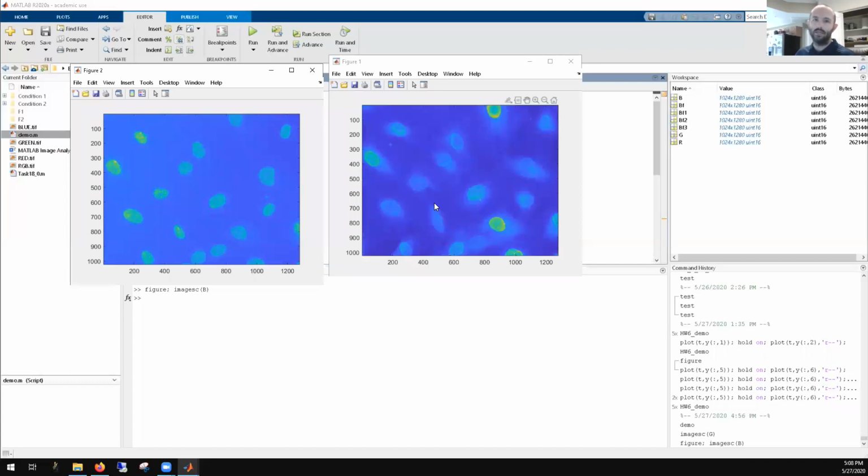And we showed that last time we made an RGB, a red, green, blue version of the image. And you could show that the cytoskeleton wraps around the nucleus, Nesprin's in the nucleus, and you could see all the colors all lined up. But in this case, let's say we want to use this image because the nuclei are relatively uniformly bright to segment this image.